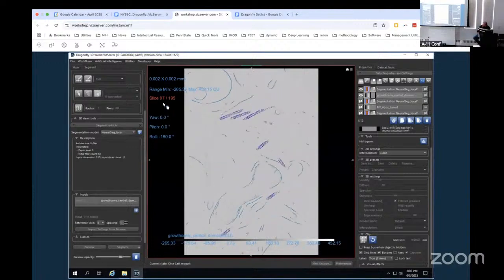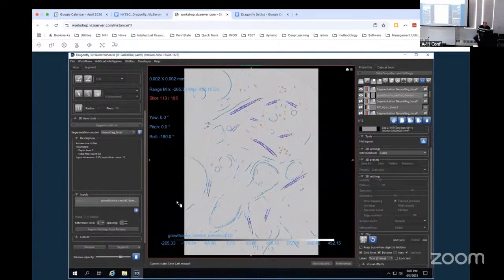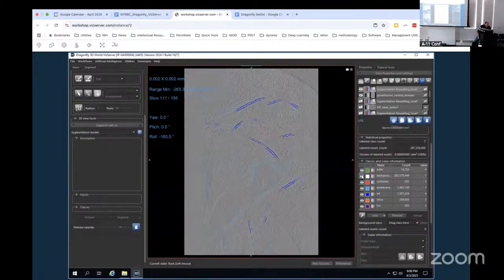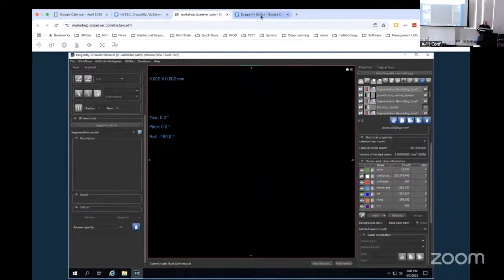But you'll see, right? So it does an okay job. It actually gets a lot of the microtubules, and hold on. And it ignores a lot of things. It gets ribosomes, much of the membrane. Now that mitochondrion in the middle, which has a matrix like it's never seen before, it's definitely struggling there. It's struggling with a number of things. It's not perfect, but it didn't take me any time. So we could even try denoising it and seeing what happens.